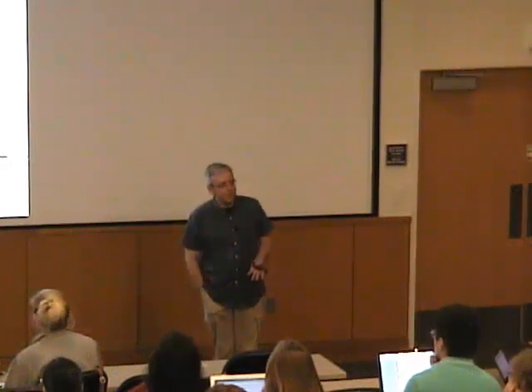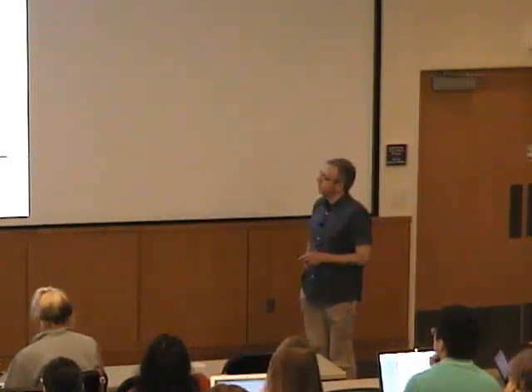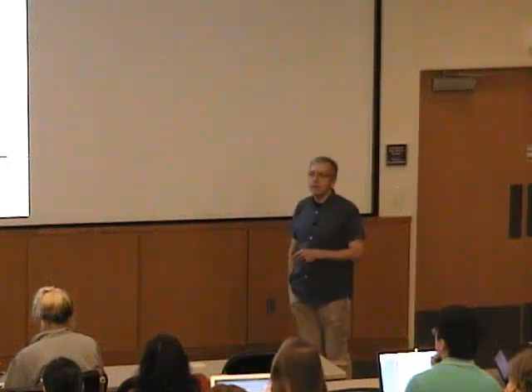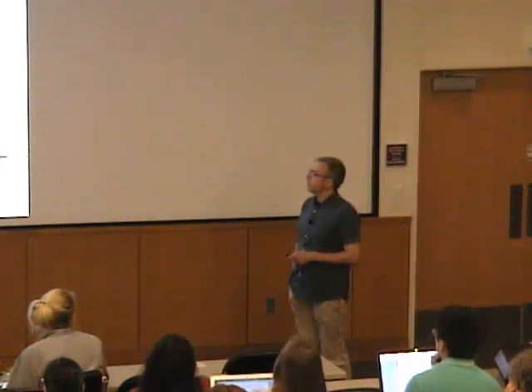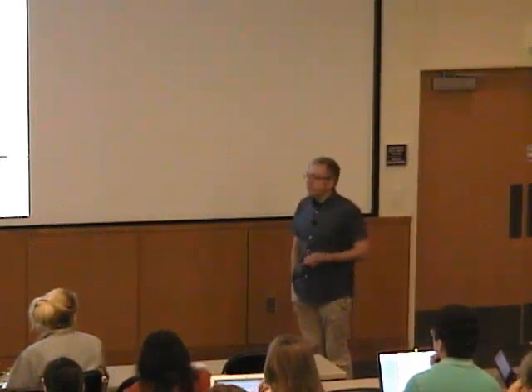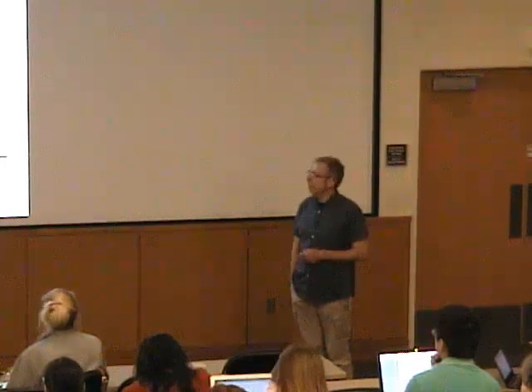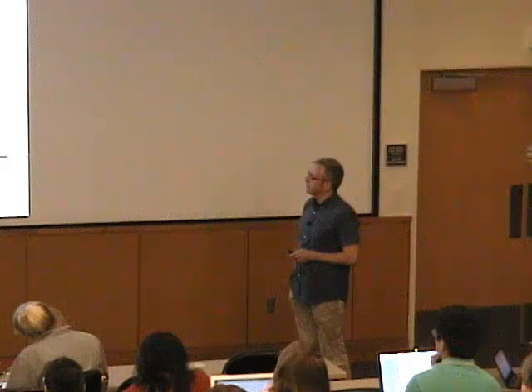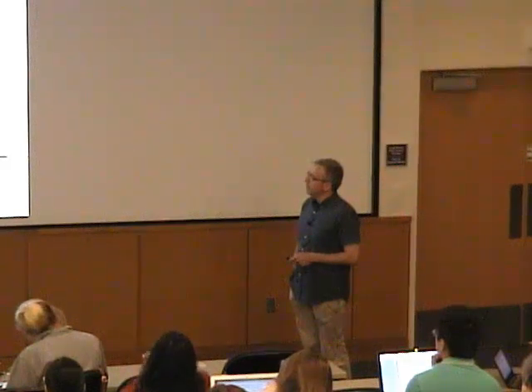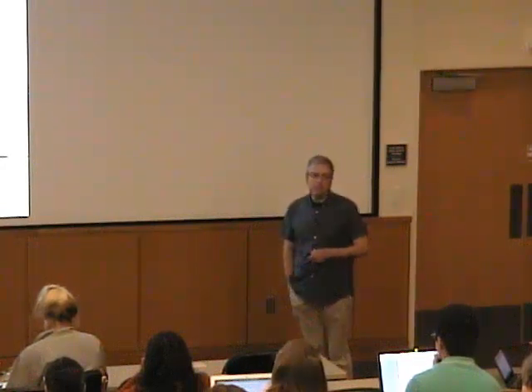But where is the wave in there? Where is the periodicity of that function? Well, the periodicity of that function is basically on the third axis that we're not looking at. So the time axis, where this rotates, is coming out of the board at this point. And what you have to imagine then is that you get your wave by this vector rotating. And if you project this vector on the real and the imaginary axis, then you see that basically these two functions, this is your periodicity that you have.